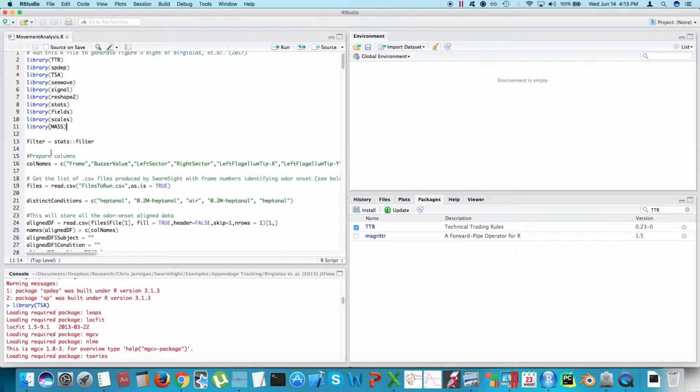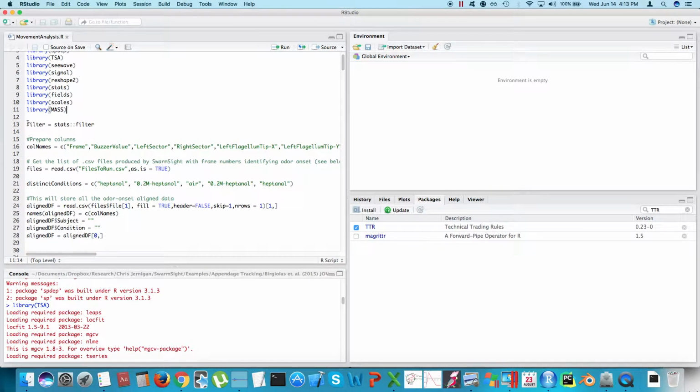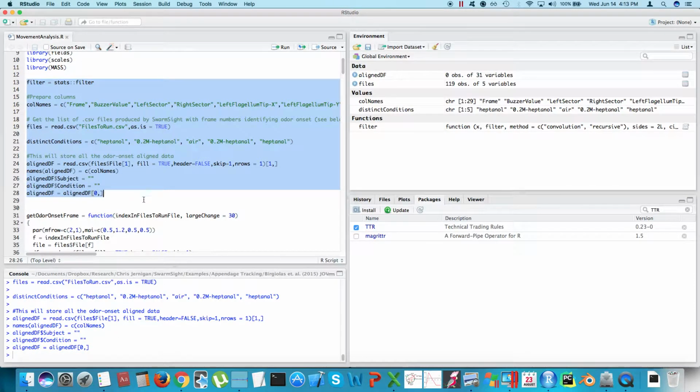Anyway, let me walk you through the other pieces of it. So what I'll do is I'll basically walk you through the code. I won't go too much into detail, but I'll explain a couple of pieces here and there. Otherwise, you basically select the stuff that you want, and then we'll run. So the first thing that I wanted to show you, we'll just go ahead and run this initialization code. Again, I'm selecting, I press Control and Enter, and that runs the code. You can also press this button after you've selected it.